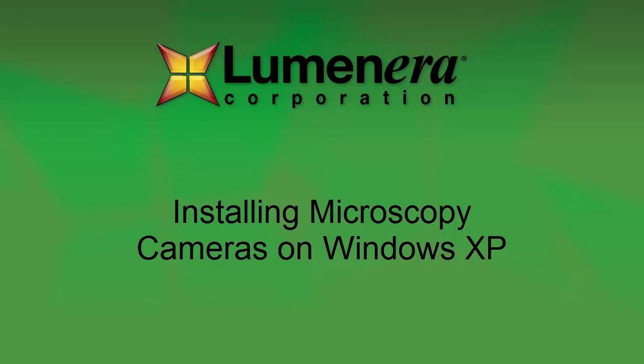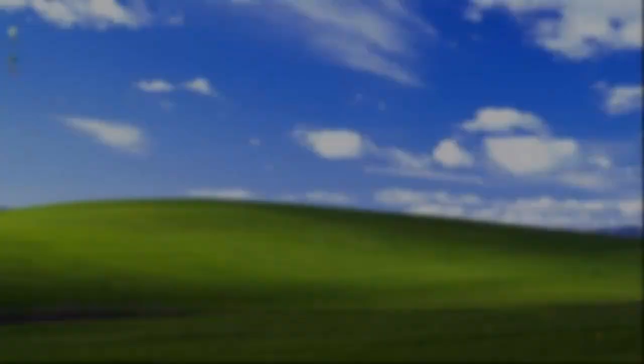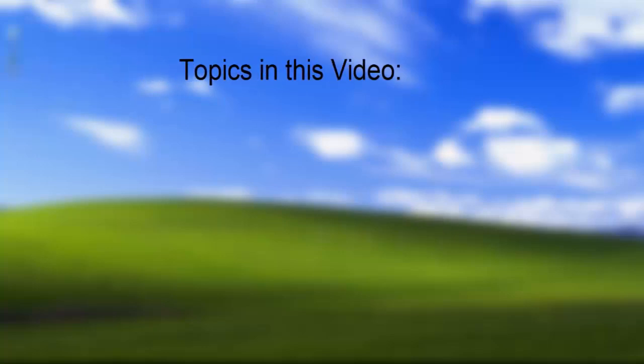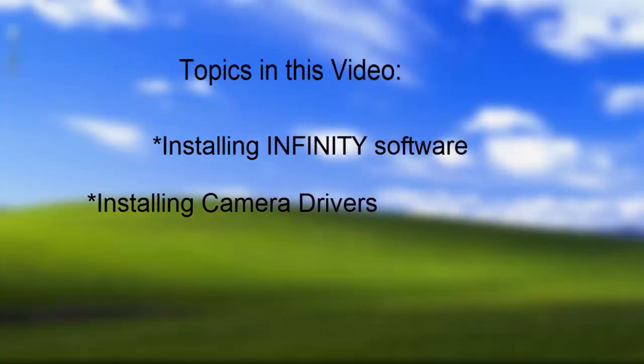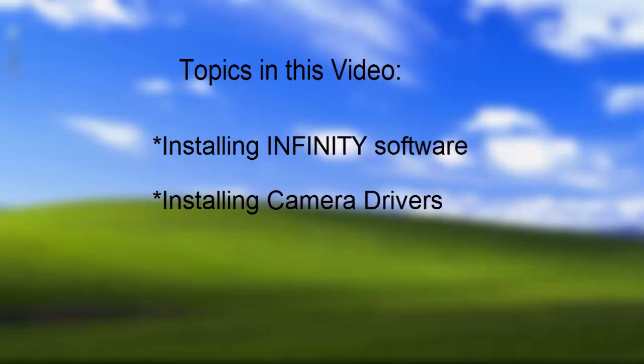This is a short tutorial showing you how to quickly install your new Lumenera microscopy camera on a computer running Windows XP. There are two stages to set up your camera: installing the Infinity software and installing the camera hardware drivers. After you complete these two stages, your camera will be ready to use.